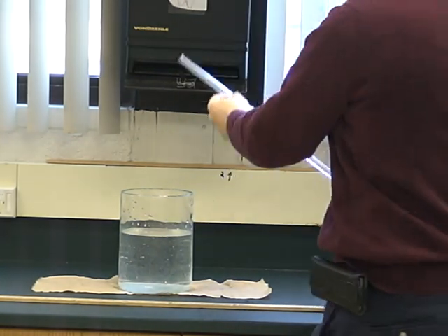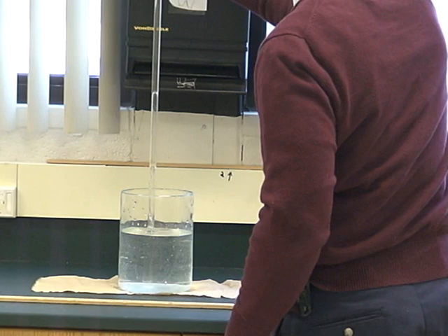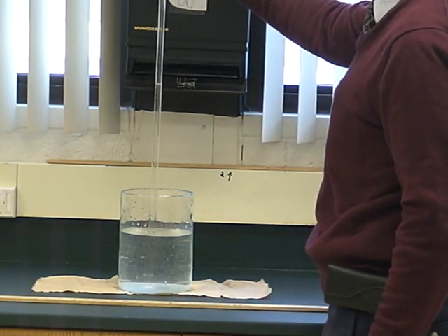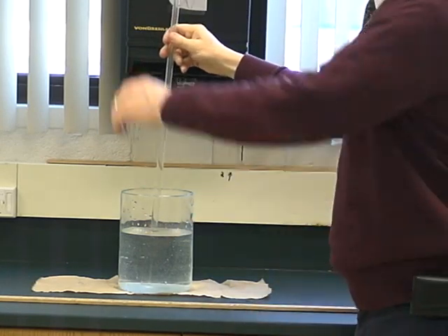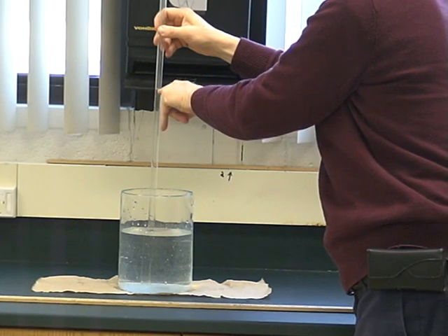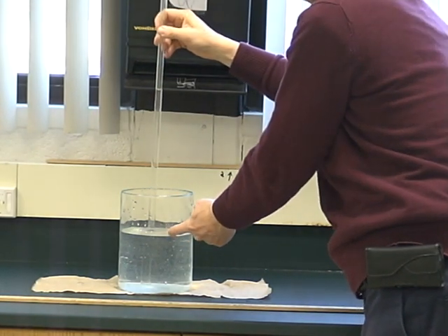What I do is I'm going to invert it into here and let it finish. Hopefully you can see it from there. The water level inside the tube is right here, and the water level inside the battery jar is down here.